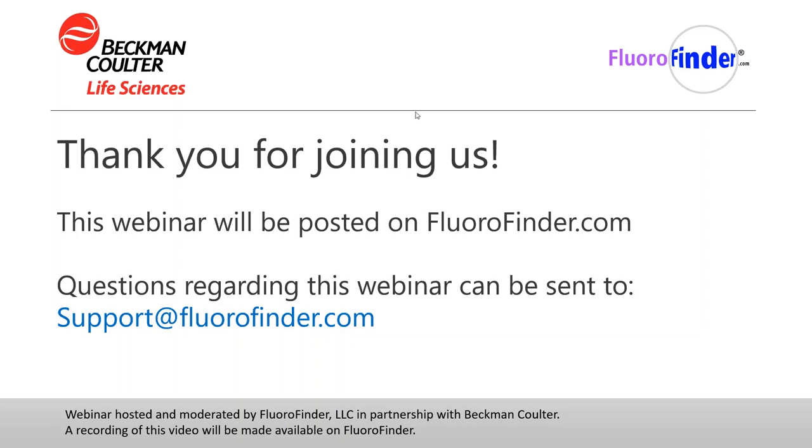Another question, we have two or three questions around BAT, so let's stick with those. One is, how fresh should the blood for BAT be? So this has been well documented over the past few years. It is preferable to work with fresh blood, so basically ideally blood that could have been drawn during the day. Most of the time we're working with blood that is between 0 and 4 to 5 hours of age. It can work beyond that, but then you can expect a decrease of reactivity.